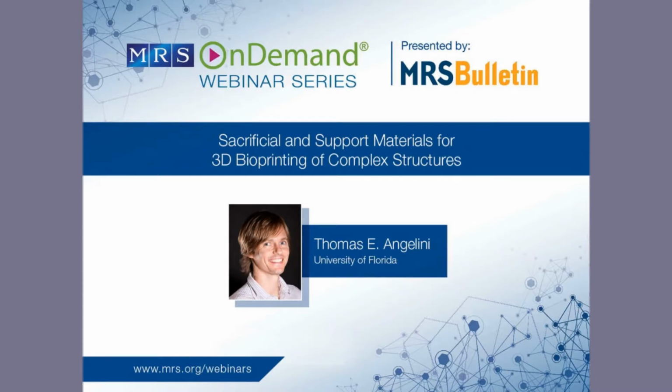Yeah, so there's a lot of opportunities. If you Google bioprinting on YouTube, you see all these commercially available bioprinters. The way it's often thought of is I have one syringe or container filled with cell A, another with cell B, another with cell C, and some matrix, and my robotic arm or gantry system goes around, picks up a container, prints, puts it down, and picks up another one. That's the most common way I've seen people envision multiple materials and multiple cell types.